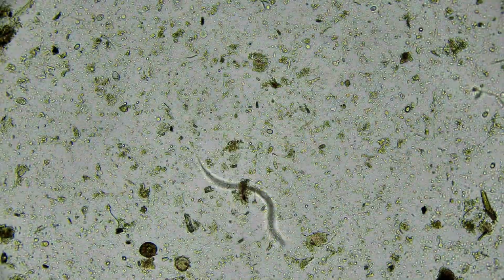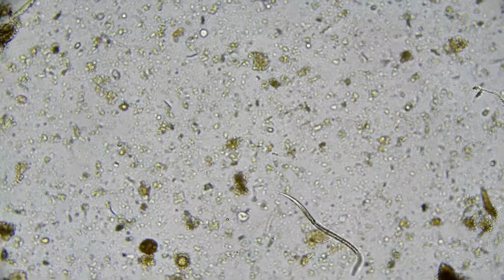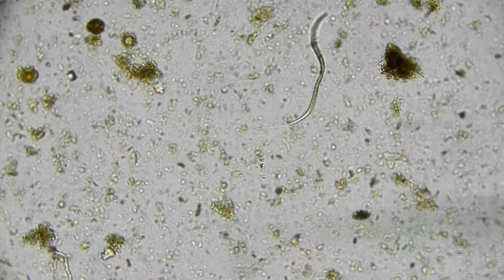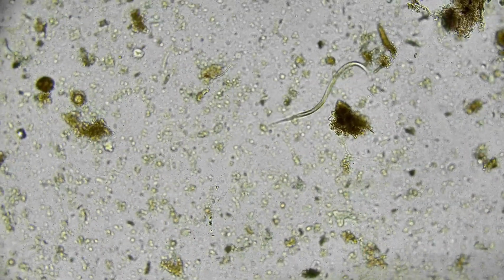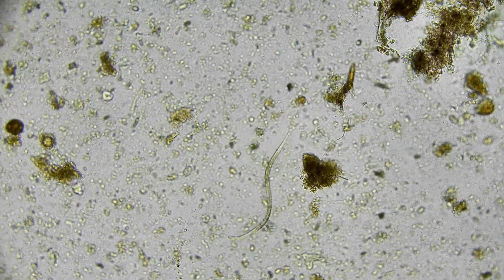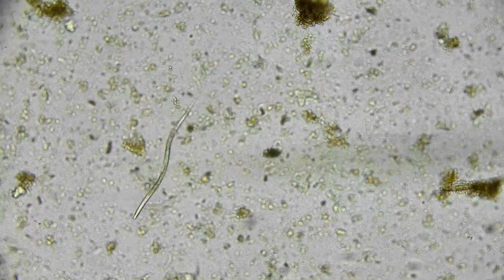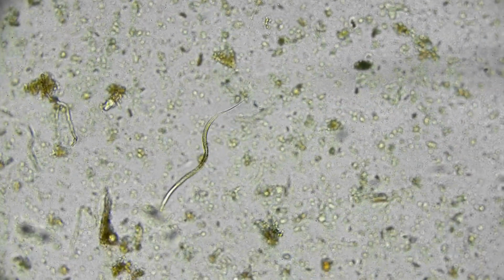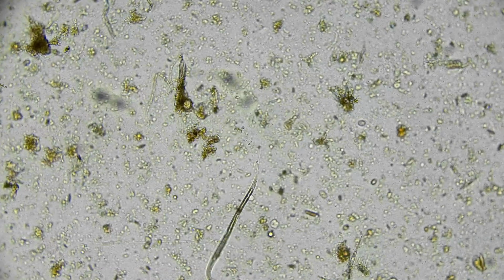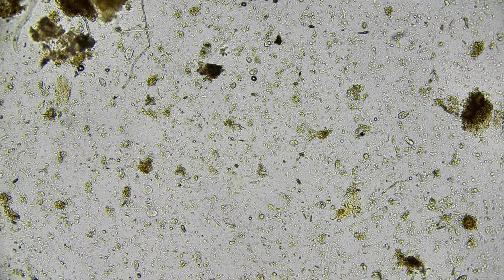Ooh, let's back that up. That is a nematode photobombing my video. I think it's on turbo. So I will not be able to identify that. It's moving way too fast. So I'll just keep moving. Let's see what else we find. I'm sure there's a lot more in here.